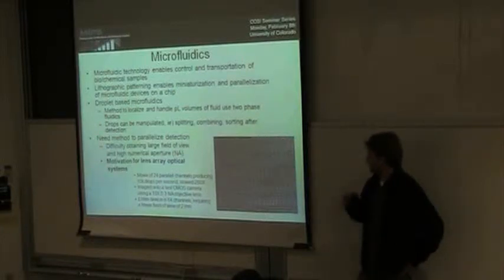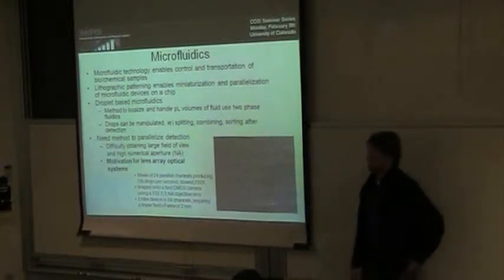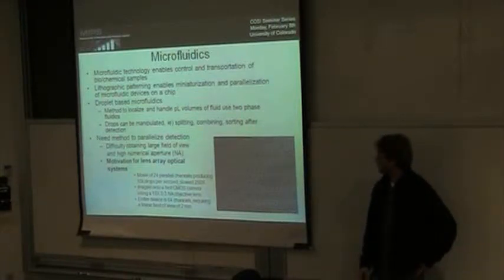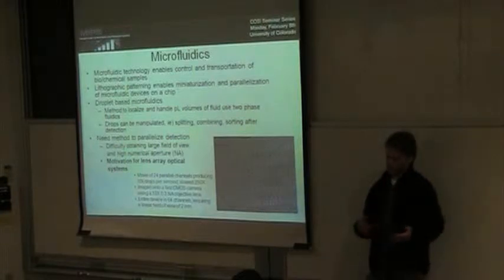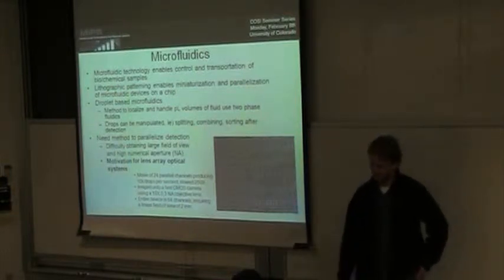Traditionally, the fluorescence is read out of these drops just by focusing a single laser beam onto a single channel and just measuring the fluorescence that is both excited and collected through an objective lens. But if you parallelize the system, you end up with a large area device, and it's difficult to efficiently capture the fluorescence over this large field of view.